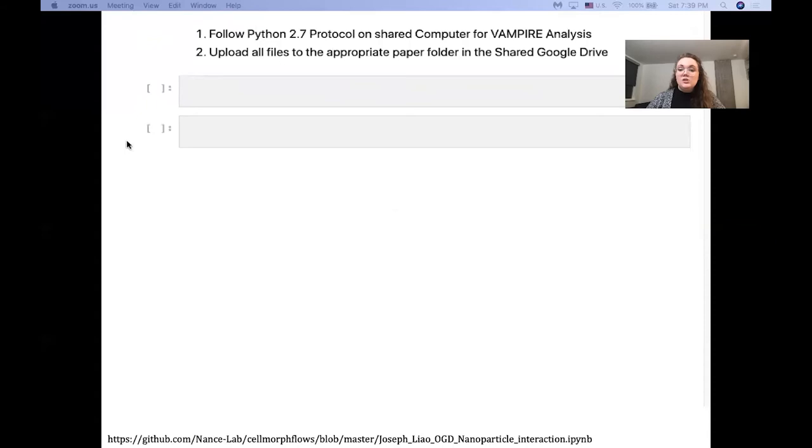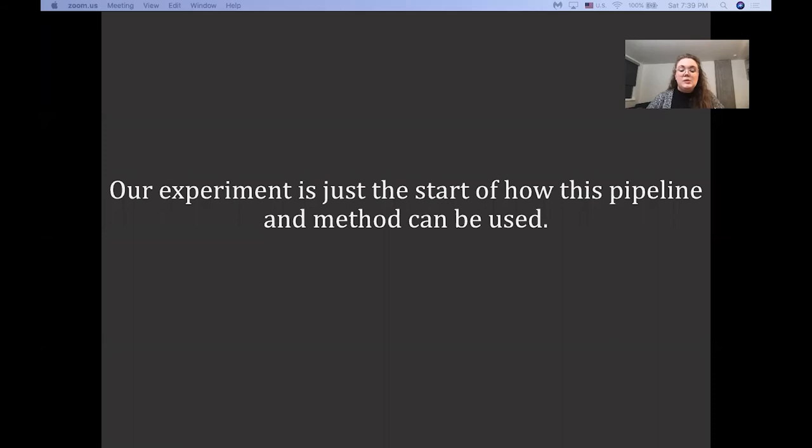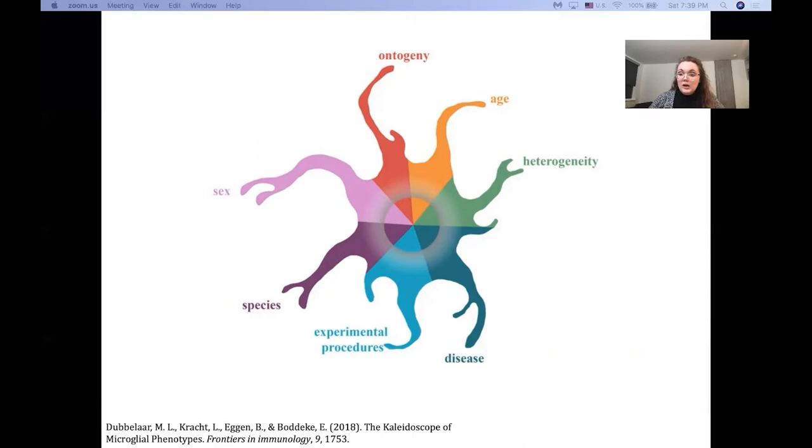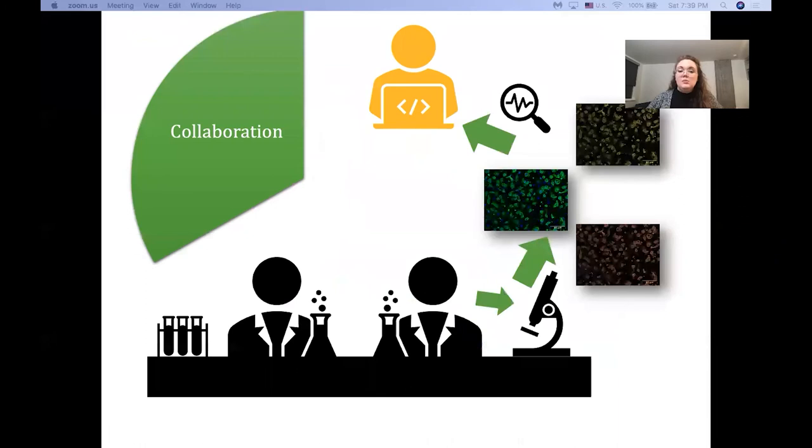And while I showed you this Jupyter notebook for one specific experiment, it's important to understand that our experiment here is just the start of how this pipeline and method can be used. There's so much complexity to our images and so many factors that affect microglia phenotypes that we want to actually apply the same pipeline and notebook to so many different images.